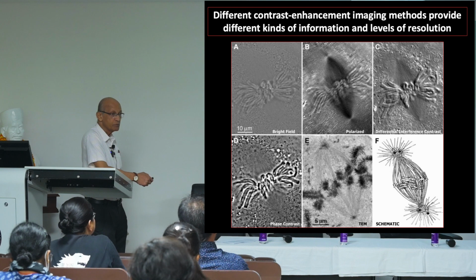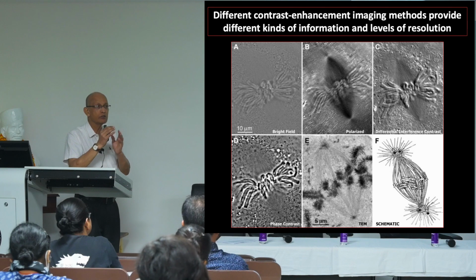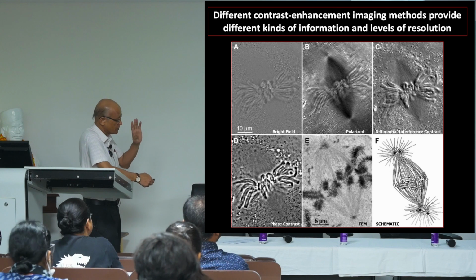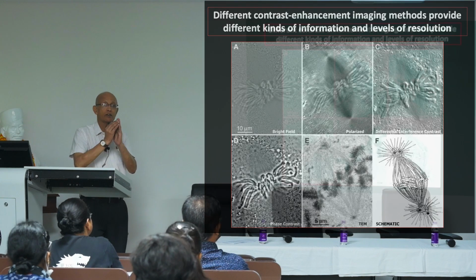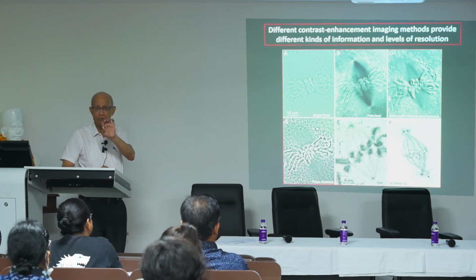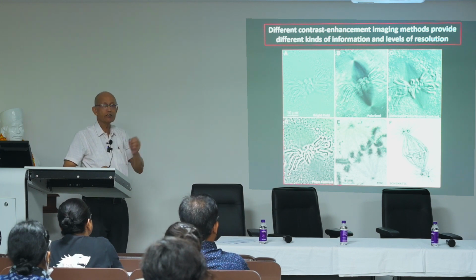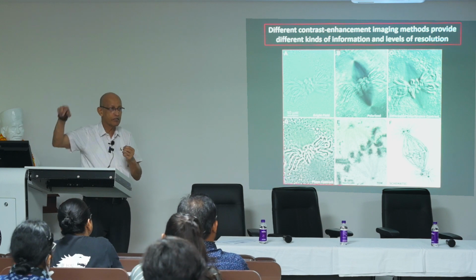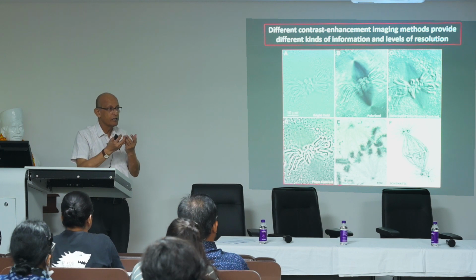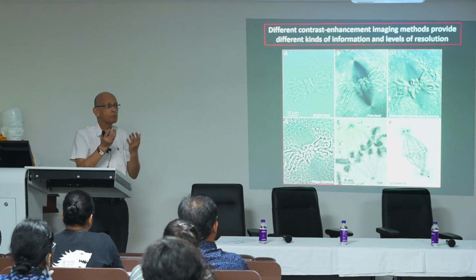Dark field microscopy works on the principle that direct rays of light do not enter the objective. It's only refracted rays that will enter. I'm sorry, this is polarized, not dark field. Polarized means light waves which are oscillating only in one plane. When we say light is traveling in this direction, light as a whole is traveling in this direction, but individual waves oscillate in different directions, 360 degrees or more, depending on how fine you take the angle. And standard normal light that we see is unpolarized.